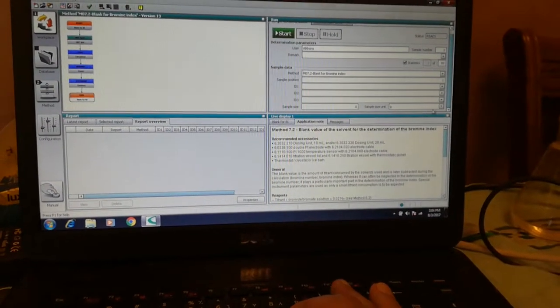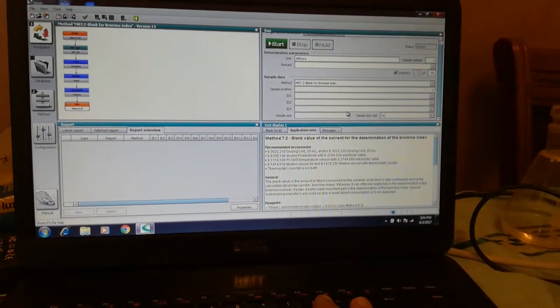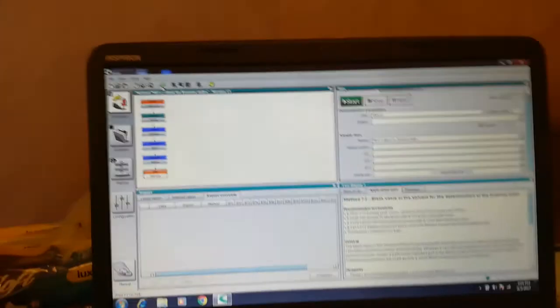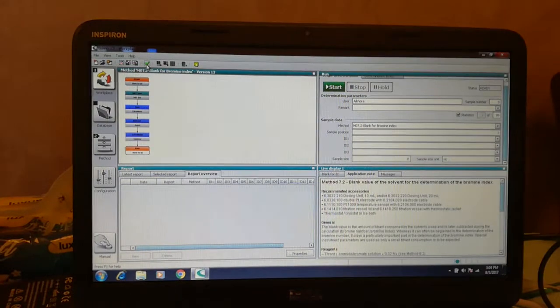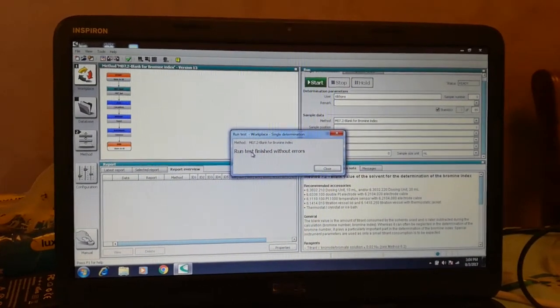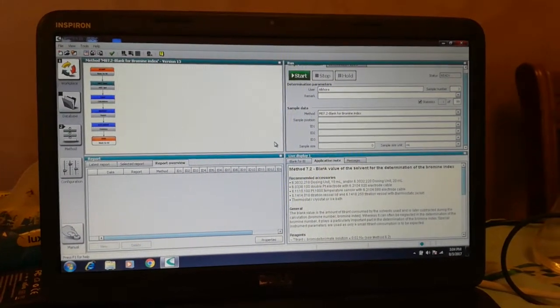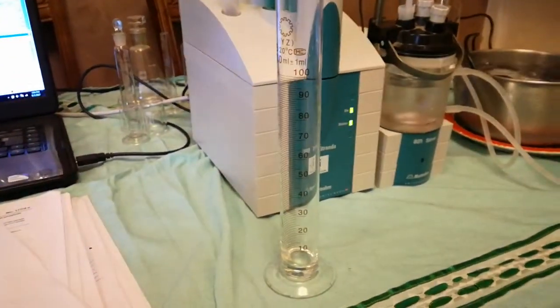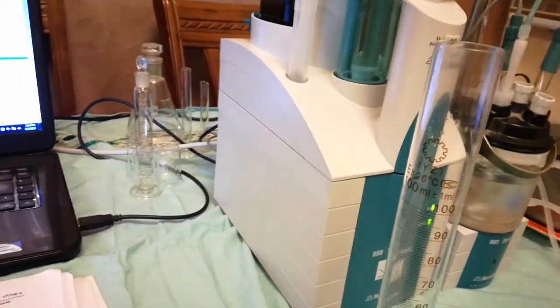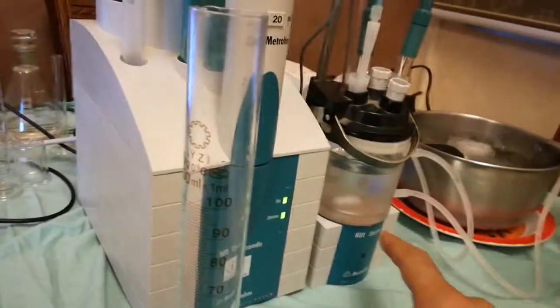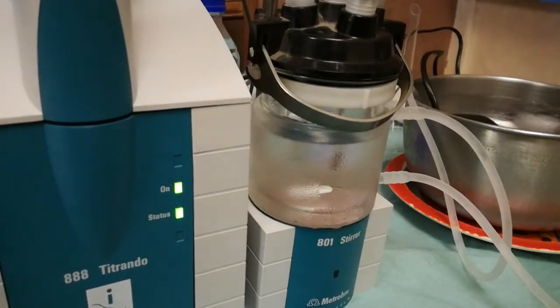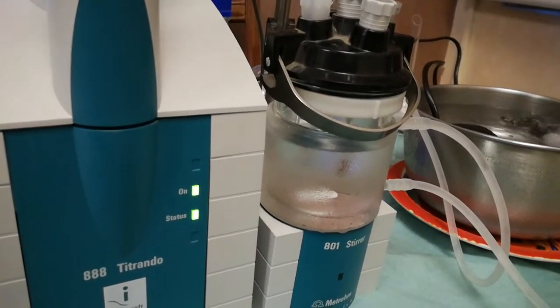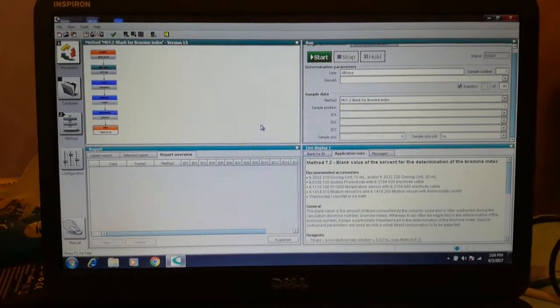We're going to select the blank for bromine index. The sample size should be 0 and the unit in milliliters. Then check the setup of the method — we tested it and it's okay without errors. Now we should use a cylinder of 100 milliliters, just like this one.